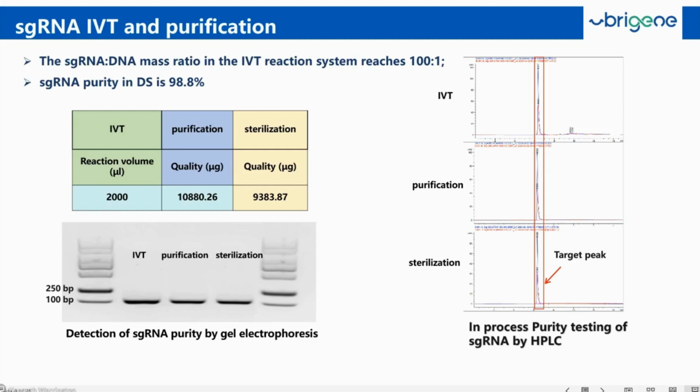Again, demonstrating here the purification with the identification of our target peak through in-process purity testing using HPLC, as well as an image demonstrating the detection of the purity of our small guides following purification.